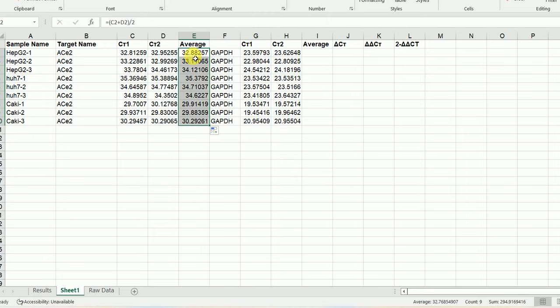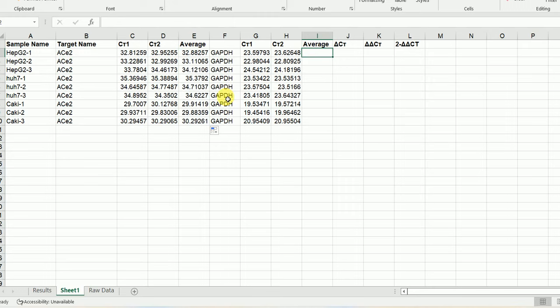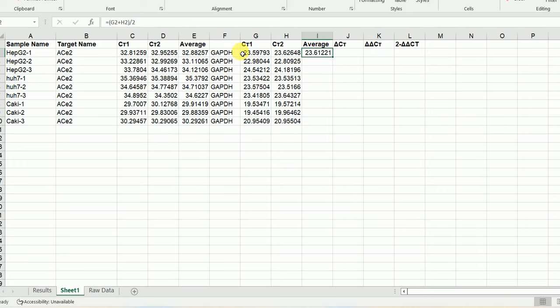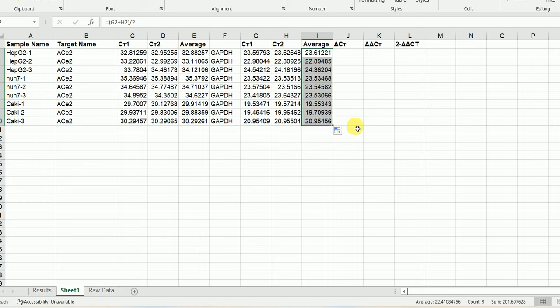Now we have calculated the average Ct value for ACE2 for each of the samples. The next thing we're going to do is also calculate the average Ct value for GAPDH. This is our reference gene. We select this plus this one, divided by two. Now we have the average value for our first sample and we'll just drag it down to calculate the average for all the samples.